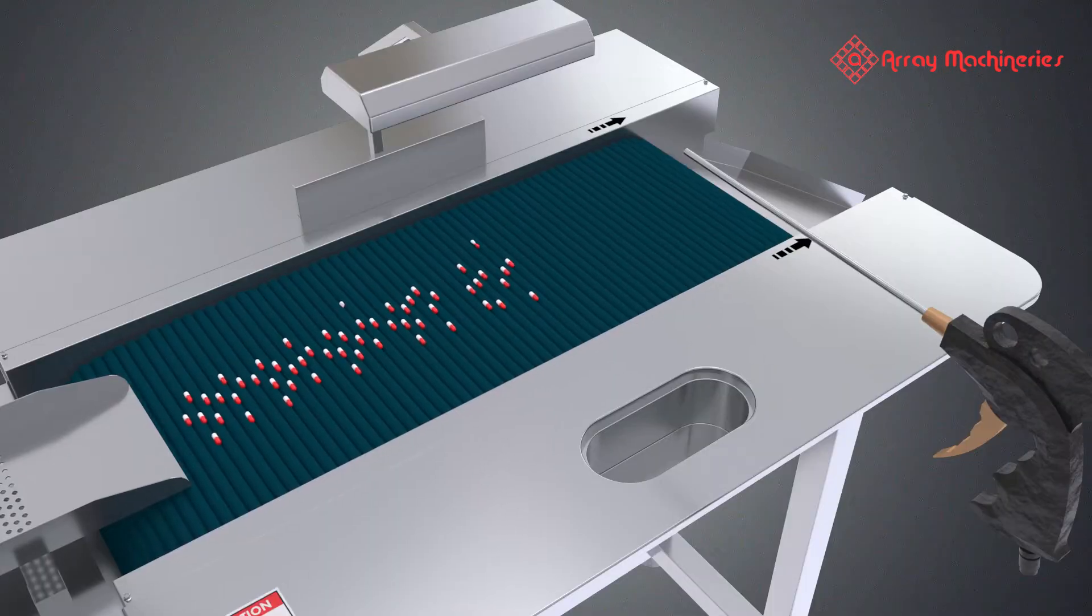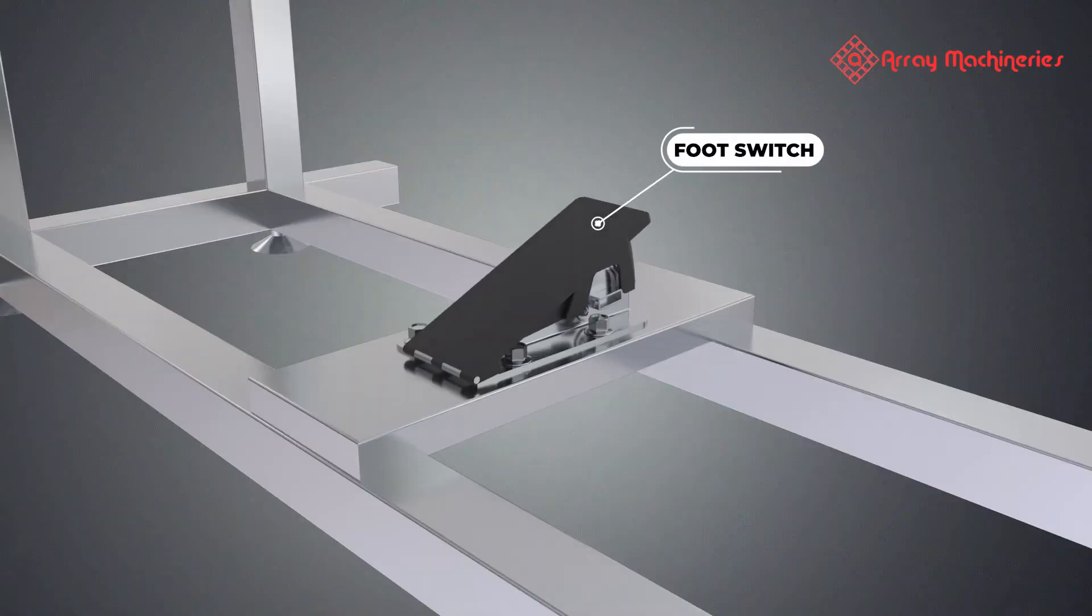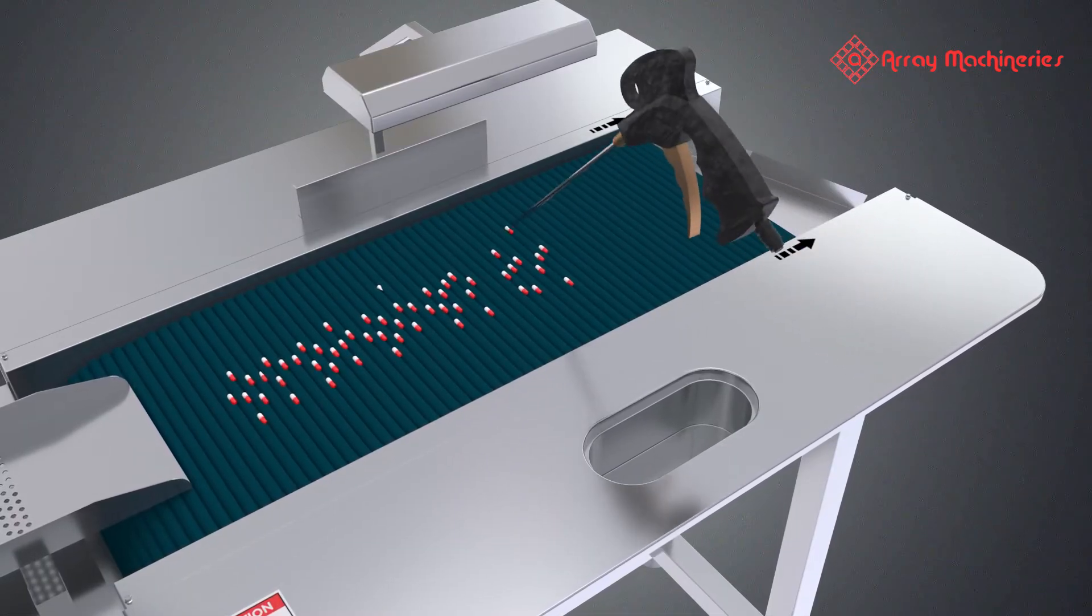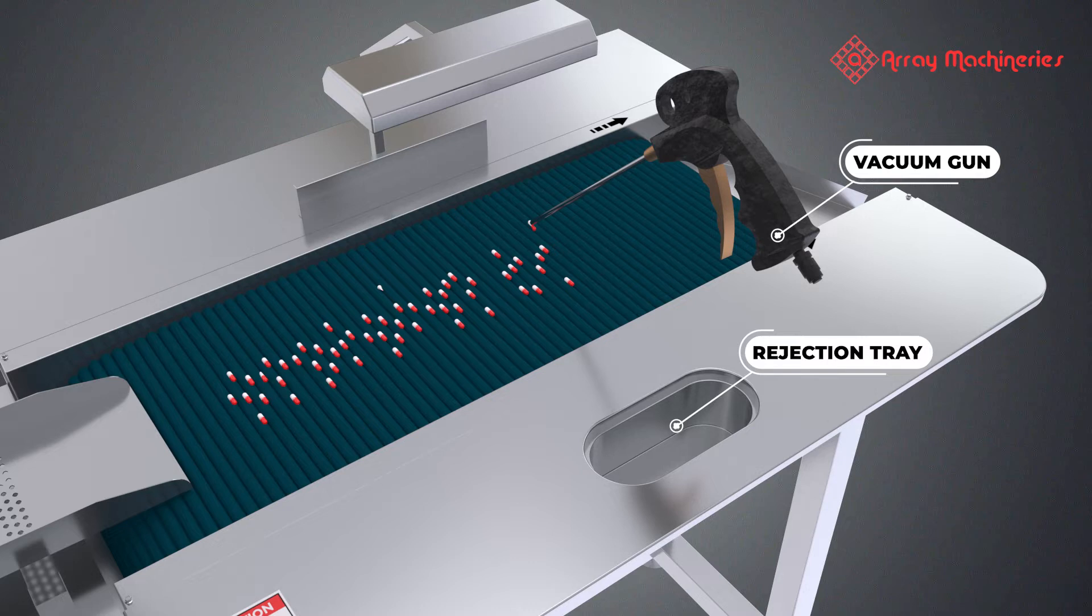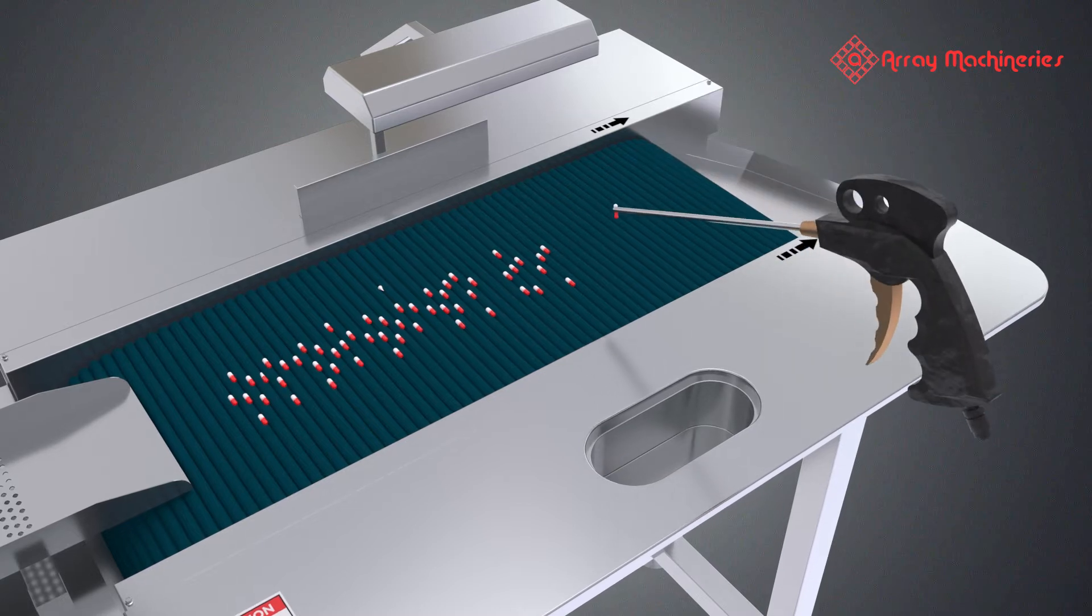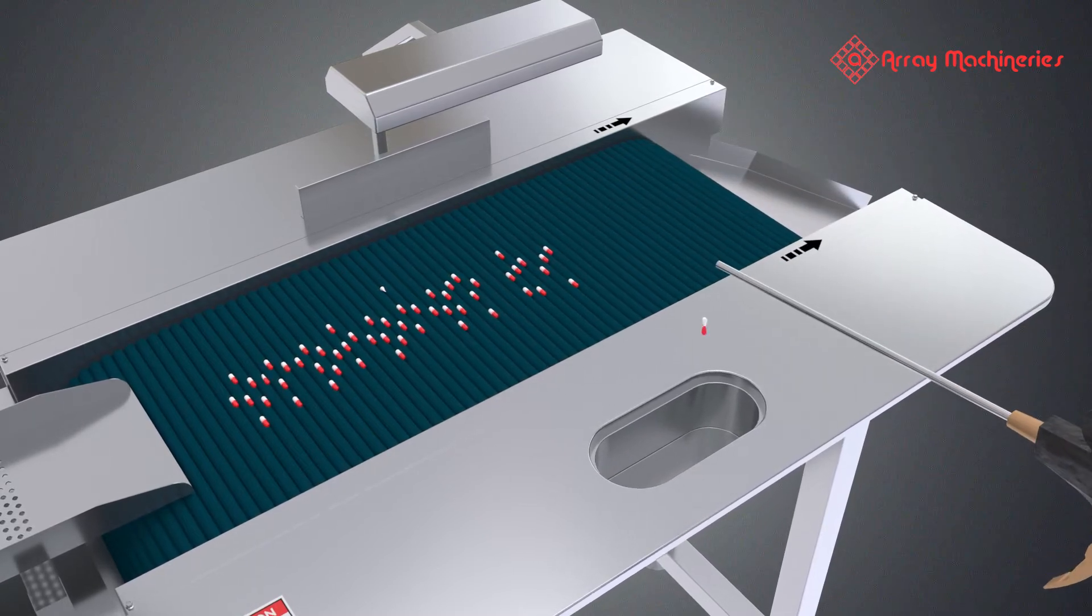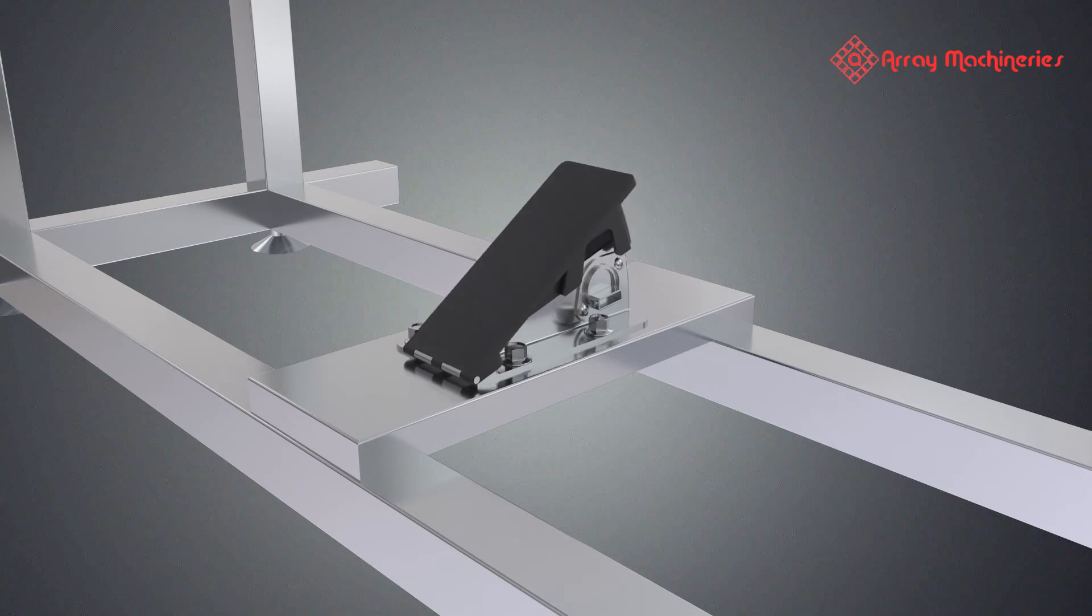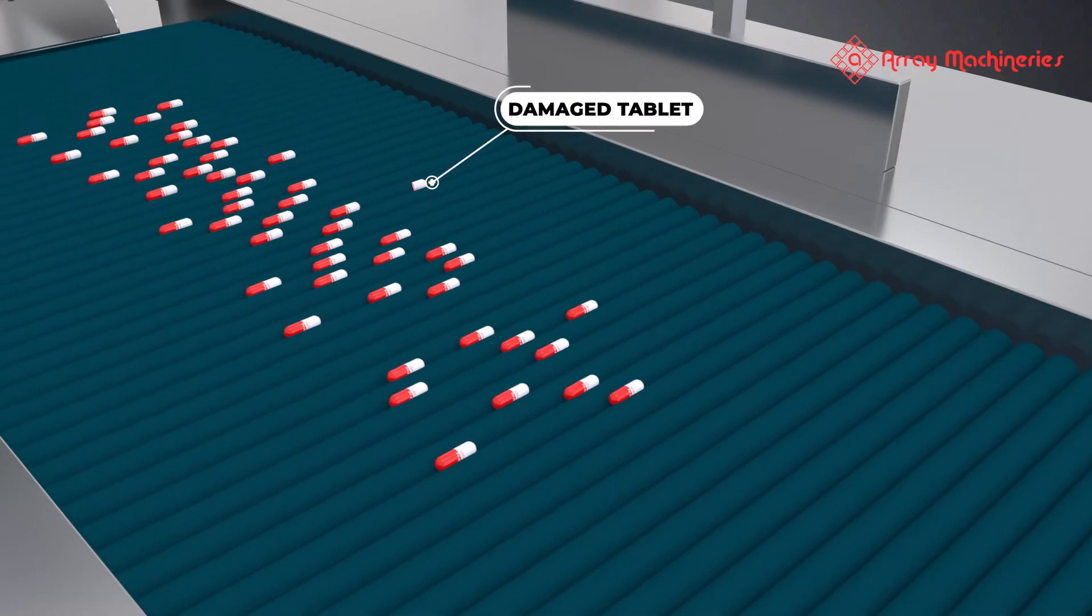In case of any defect found, the operator presses the foot switch to temporarily stop the machine to remove the tablets. Once the operator releases the foot switch, the machine automatically starts again.